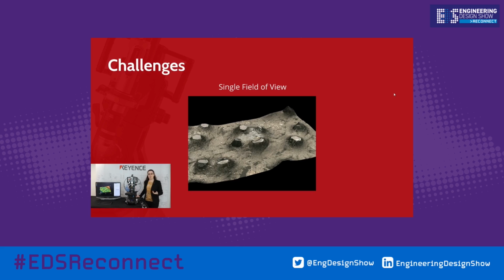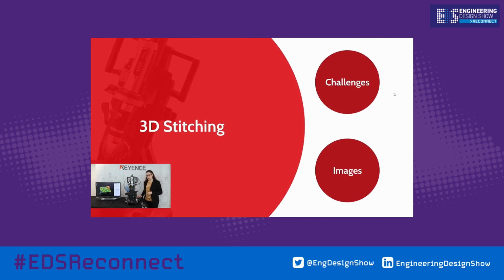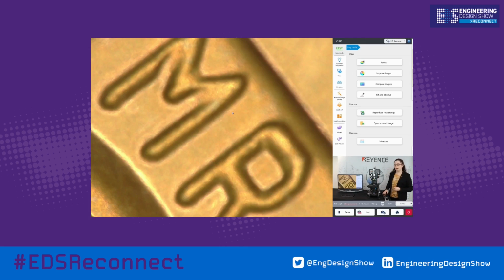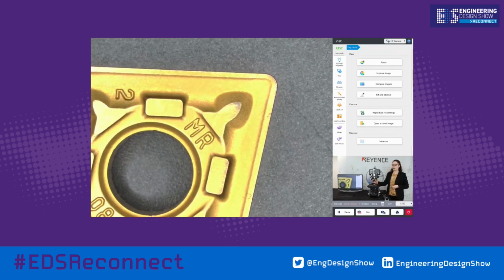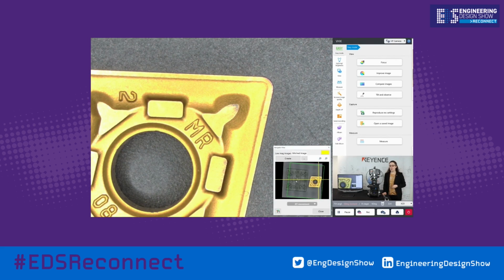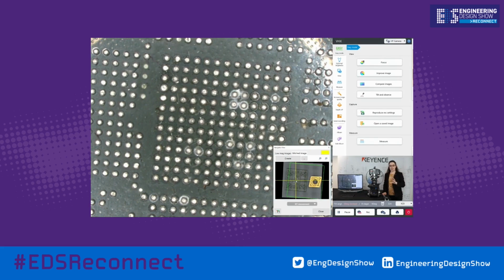Well, we can employ something called 3D stitching, and I'm going to show you how this works on our microscope. So I'll switch back. Now I've got something else on the stage here to show you. If I just zoom out, I'll be able to navigate to it properly. Here we go. It's just a PCB with a ball grid array on it.